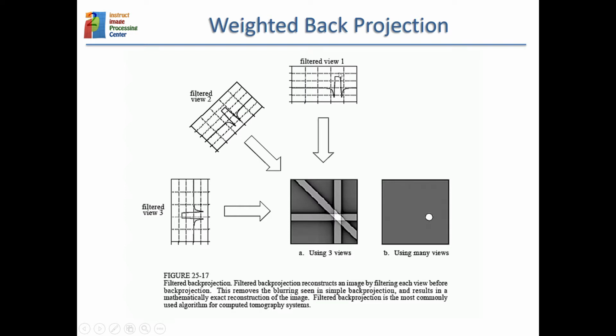So let's say that this is 1.5 in these scale units, whatever they are. And since we know that this 1.5 is the addition of all these pixels, we count the number of pixels. So let's say we have 100 pixels.